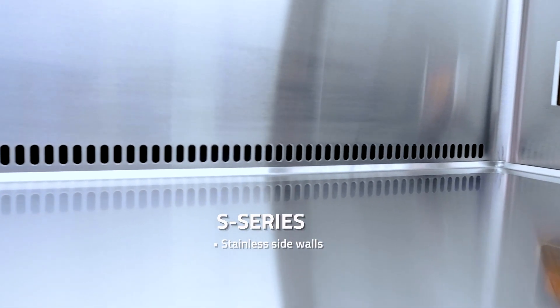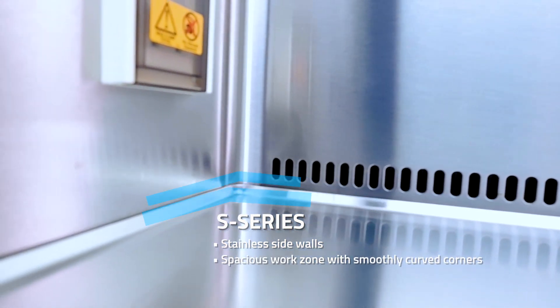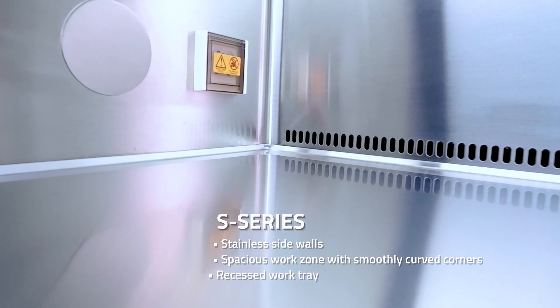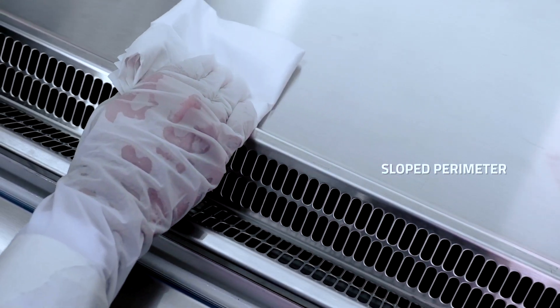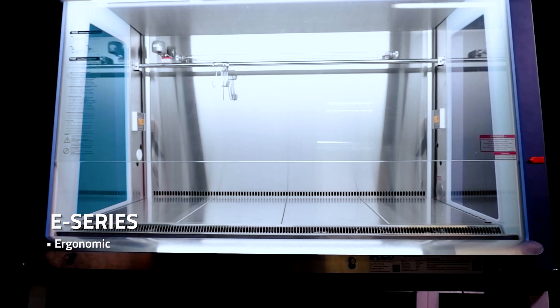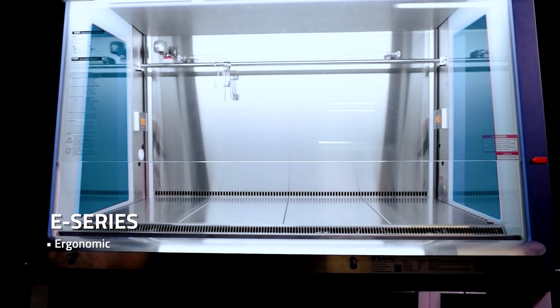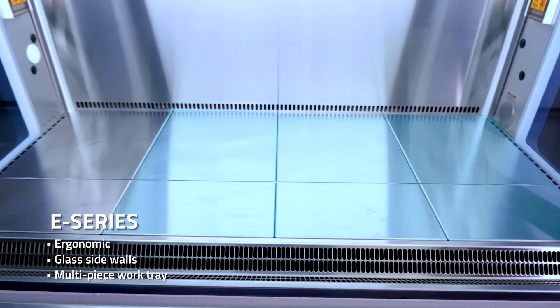The LA2EU G4S series showcases stainless steel side walls and a spacious work zone with curved corners, a recessed spill tray, and a user-friendly slope perimeter for effortless cleaning. Or the ergonomic E series, engineered with comfortability in mind, equipped with glass sides and a multi-piece work zone designed for convenience.